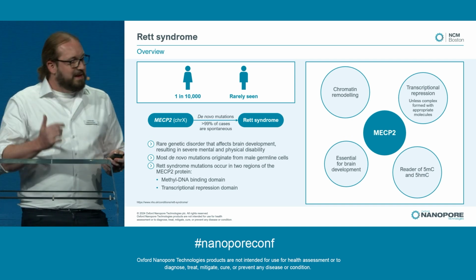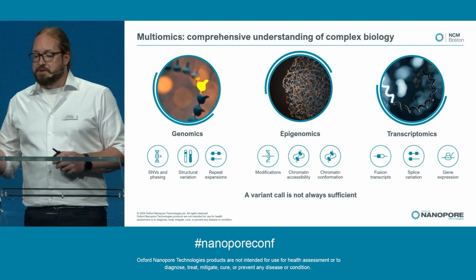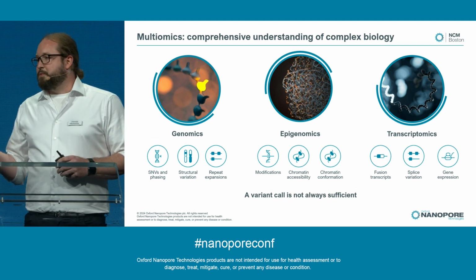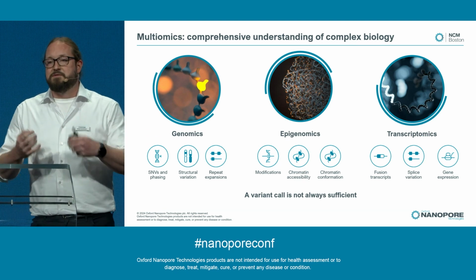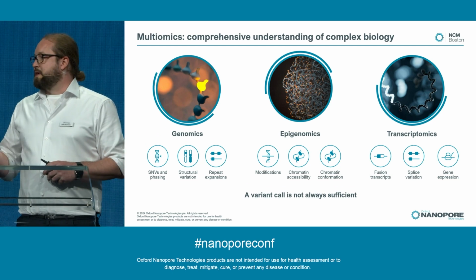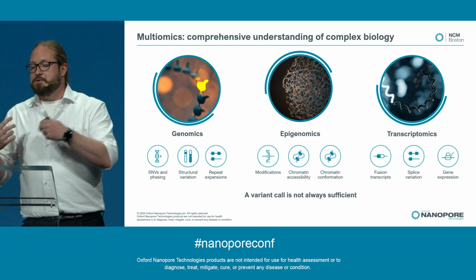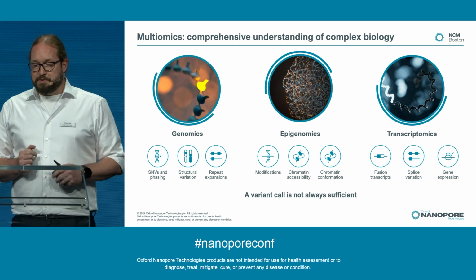More importantly, I should probably clarify what I mean when I say multi-omics. That term can obviously mean different things, but what I'm going to talk about today is how you can use genomics data, so genetic variation calling, and integrate and combine that with epigenetic signals like methylation or chromatin accessibility, and then use transcriptomics data to confirm findings from those two.